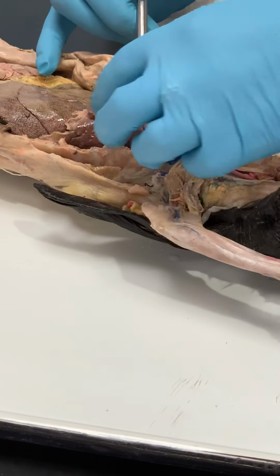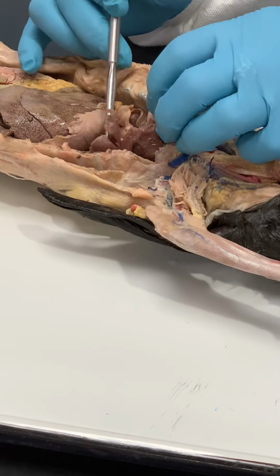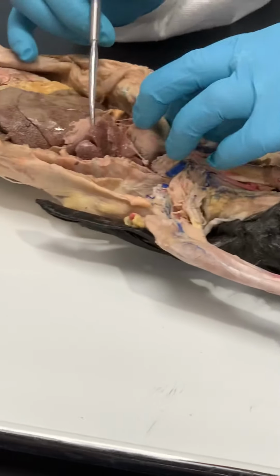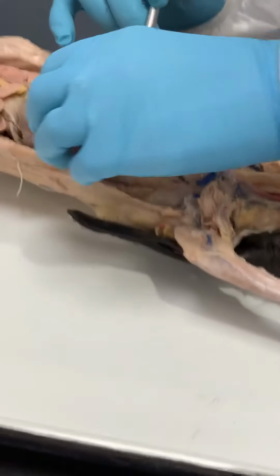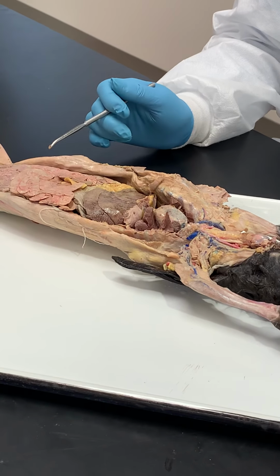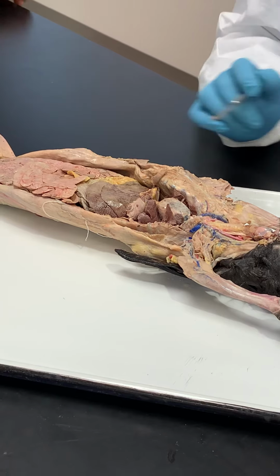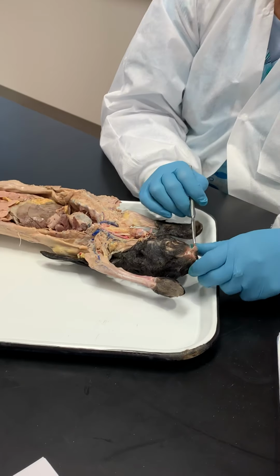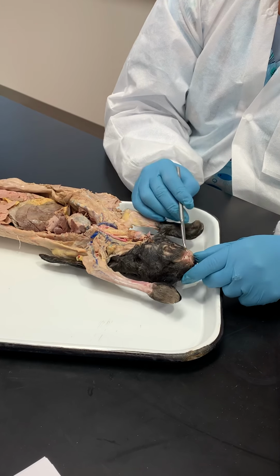Here's the lungs. You can see they're lobed, just like they are on people, right here. And then you see the diaphragm, right? This muscular bell here, dome type muscle. Okay? Mouth, oral cavity, teeth, tongue. His tongue's sticking out. Teeth are sticking out.